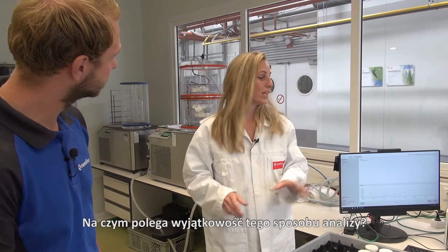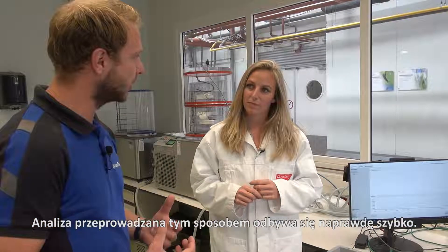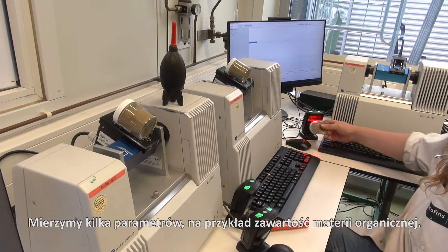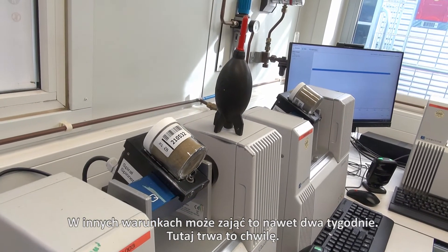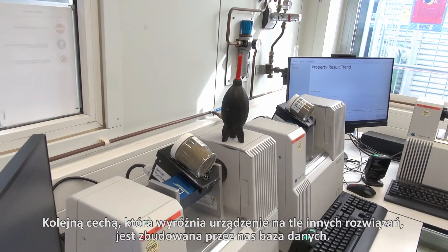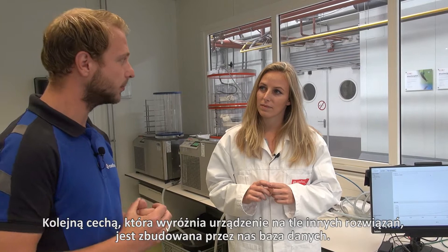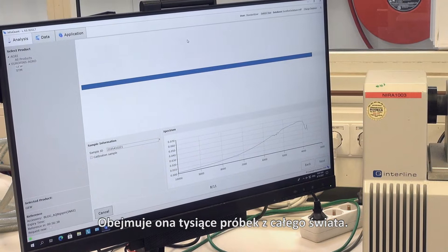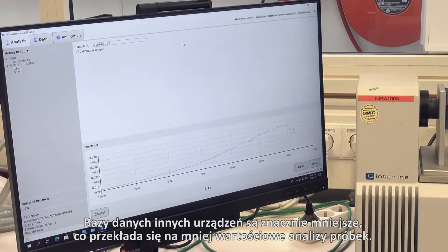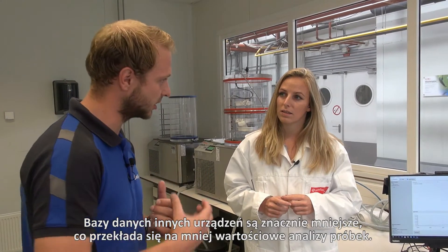So what makes this way of analyzing unique? This way of analyzing makes it possible to analyze really fast. Some parameters, for example the digestible organic matter, normally take one to two weeks. In this way we can do it really, really fast. Another thing which makes this unique in comparison to agricultural machines is the database we've built up with all the samples all over the world — it contains thousands and thousands of samples, whereas the databases on those machines are really smaller. So they cannot analyze it as well as we can here.